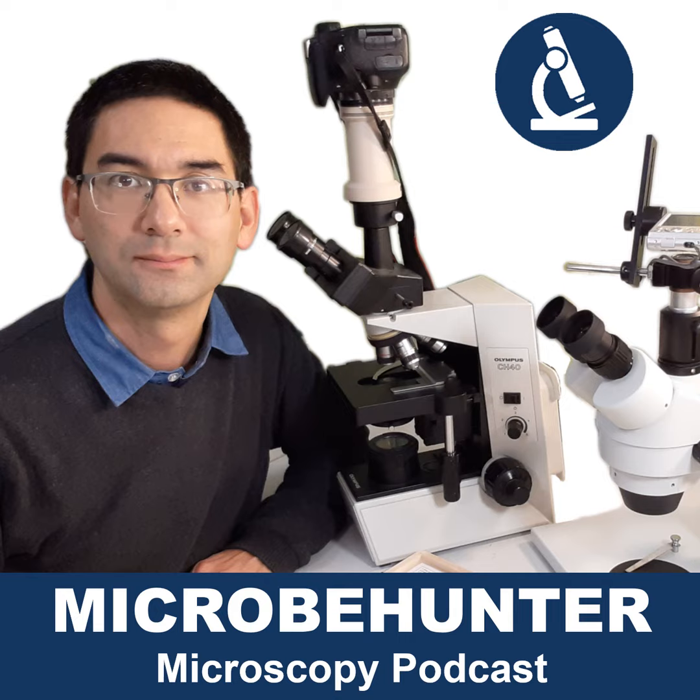You have a relatively large distance between the objective and this intermediate lens where the light rays are parallel. Now this has a significant advantage, because you can insert a variety of filters into this parallel light beam, and this does not have any effect on the focus or on the magnification of the objective. Because the light rays are parallel, if you put in a filter, the light rays will stay parallel.